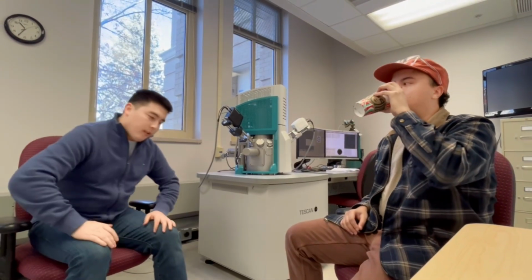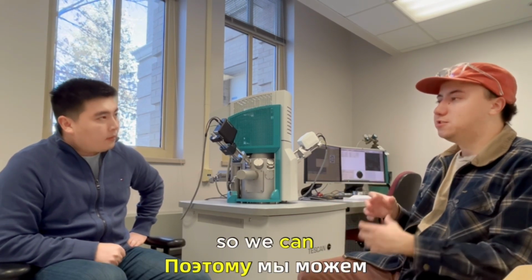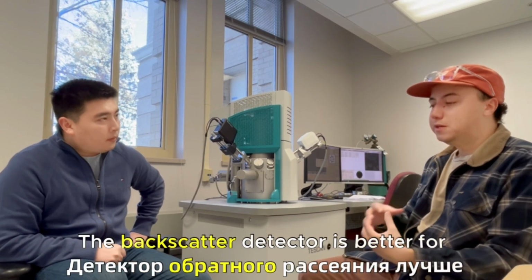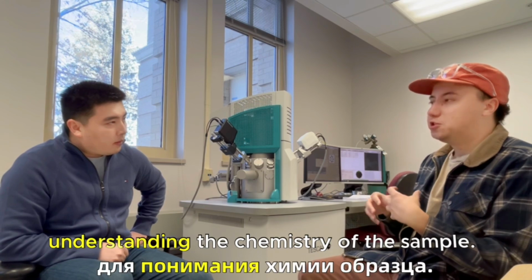You mentioned the backscattered electron detector, so it gives magnified images of the sample. Yeah. The SEM in general generates a large amount of magnification because we get a very small spot size, so we can resolve very small features. The backscatter detector is better for understanding the chemistry of the sample.